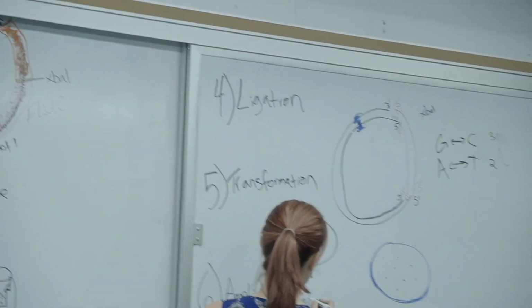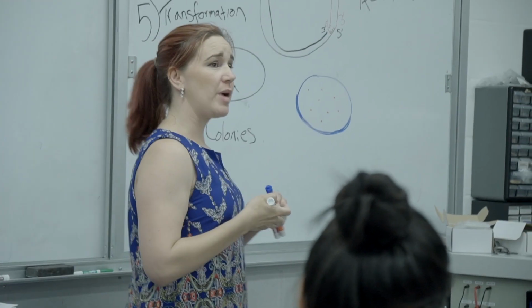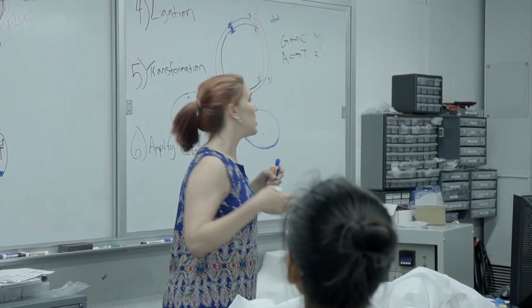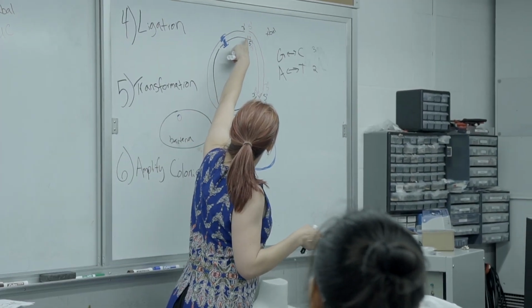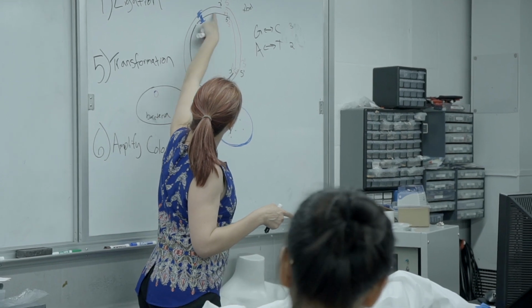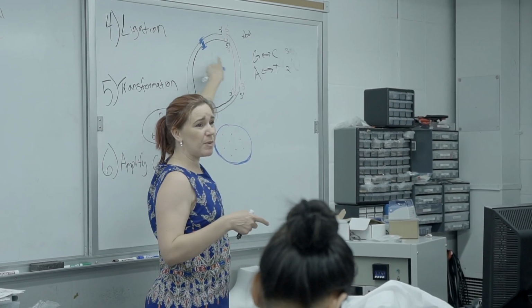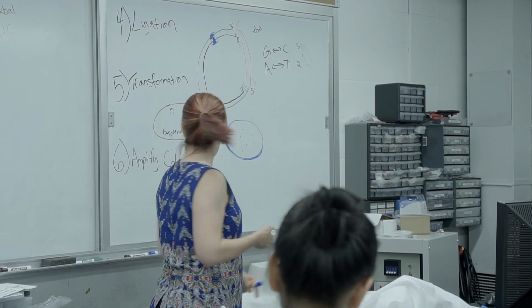So I'm going to pick, because this isn't perfect. So we had the question, how do I know? How did I know it didn't go in backwards? Or maybe, if these ends just stuck to each other for some reason, I would still have ampicillin resistance, but there'd be no luciferase in there. So how am I going to know?